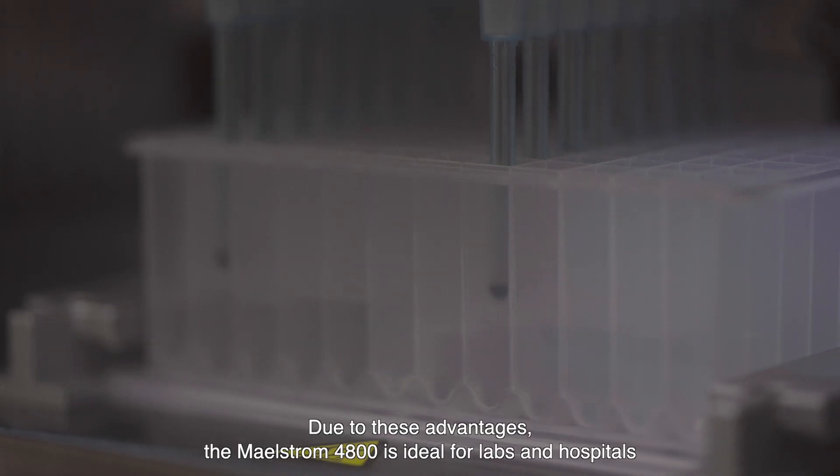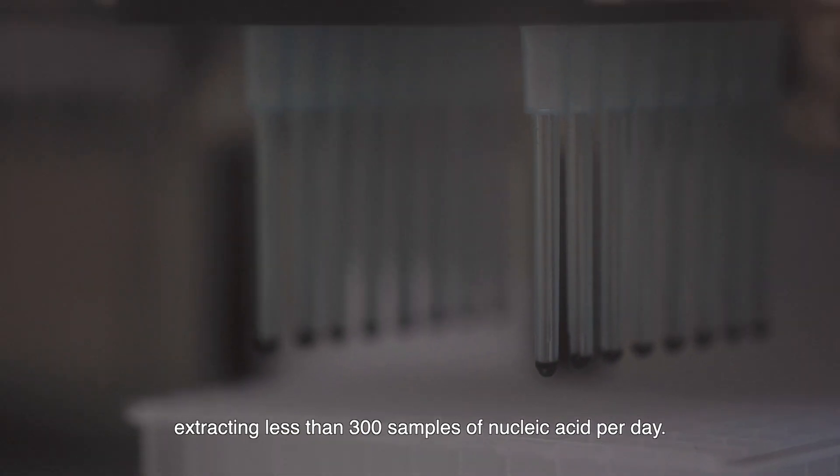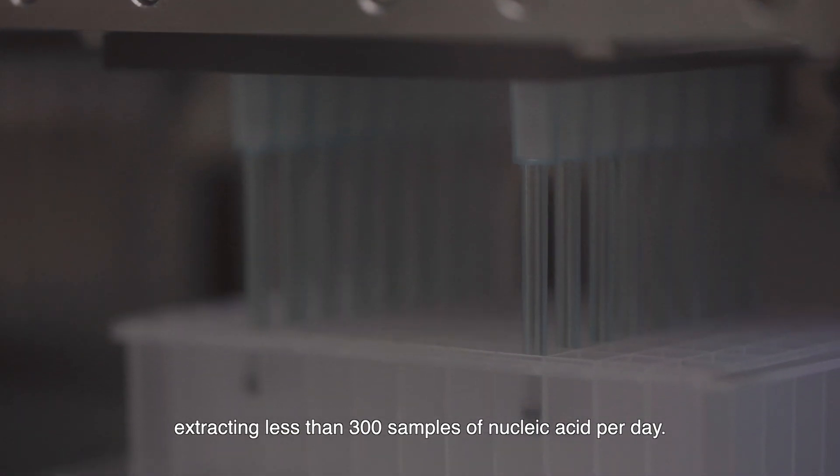Due to these advantages, the Maelstrom 4800 is ideal for labs and hospitals extracting less than 300 samples of nucleic acid per day.